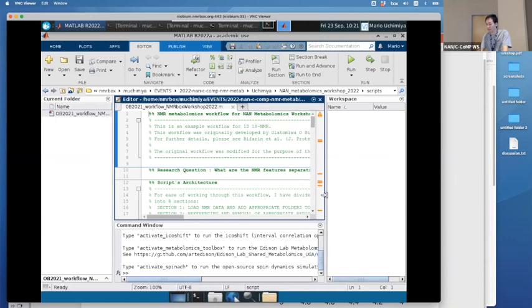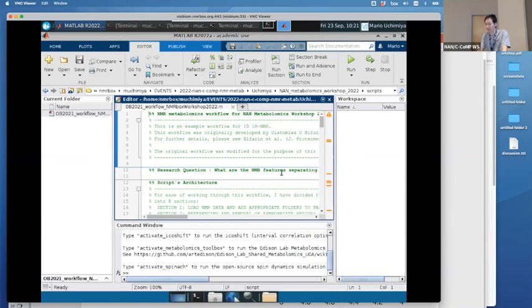And so the thing that most of you will run into, if you get an error on the first command that you run, is almost certainly that you weren't in the correct directory when you started this. So you've got to be sitting in this scripts directory, open up that script, and then you start that command. And then within that script, it's going to change directories and things, but you have to be at that starting point to make it work right.